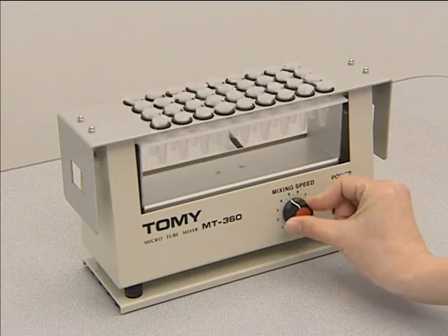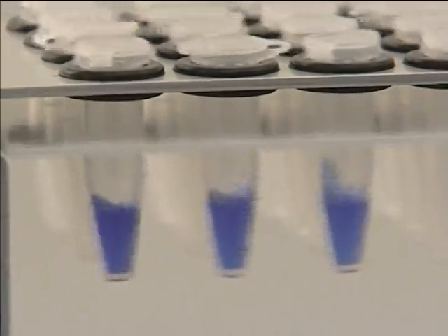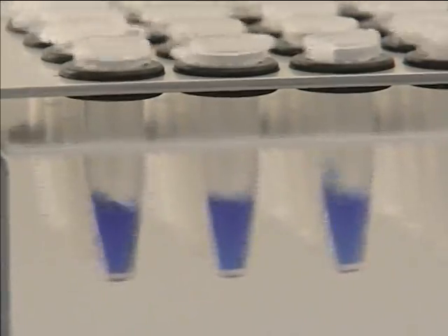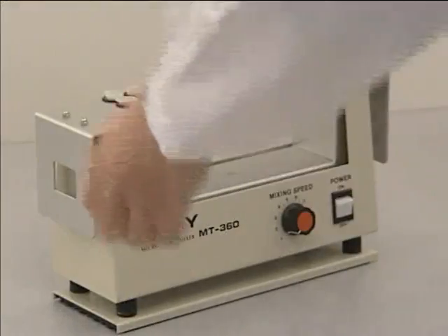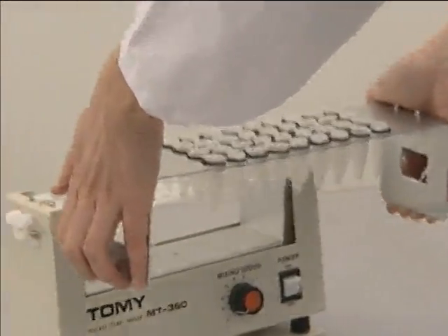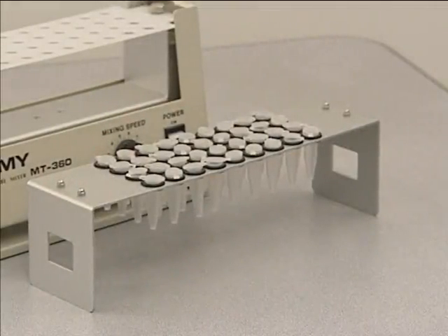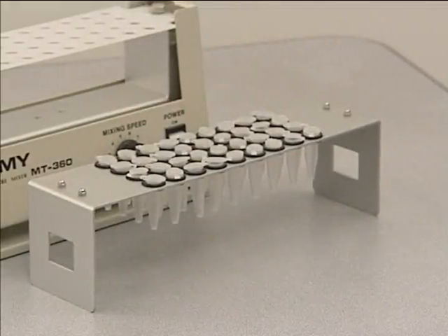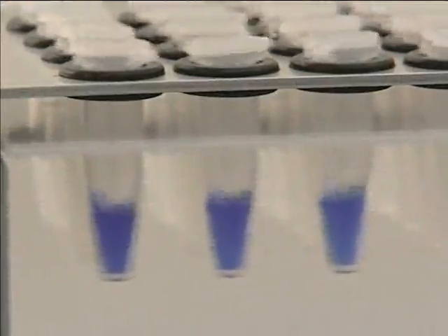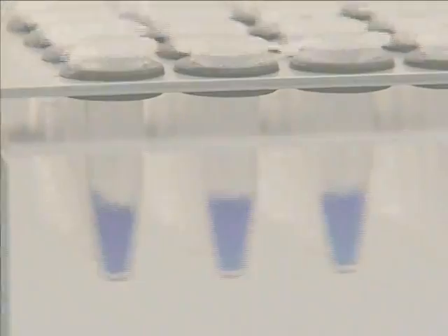Speed can be adjusted easily from minimum 1 to maximum 10 just by turning the dial. The MT360 is supplied with a unique detachable tube rack — simply pull the rack out of the main unit. As an optional accessory, we also offer an adapter which can accommodate two microplates. For further information on the MT360 Microtube Mixer, please contact your local Tommy dealer.